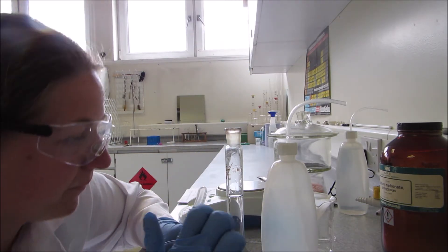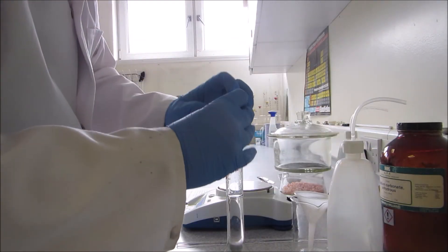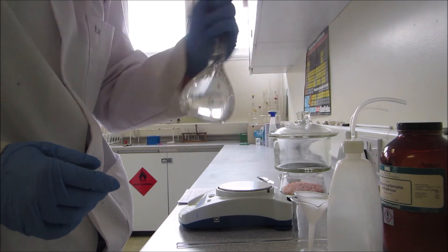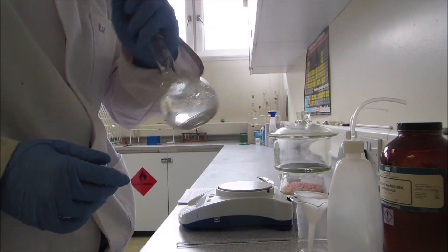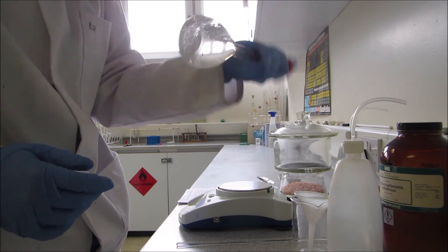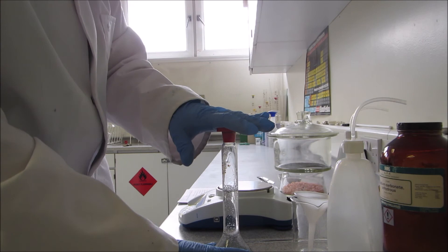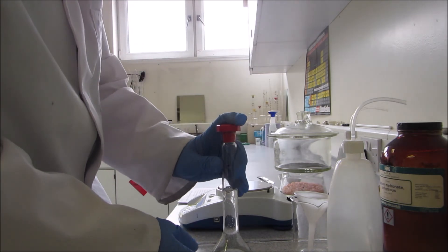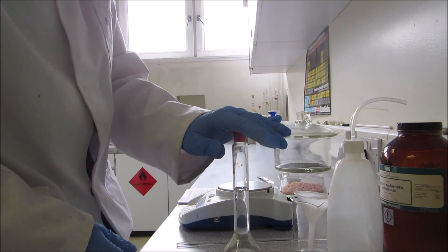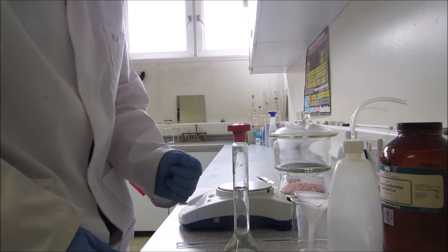And there we go. I put on my lid, give it a shake, and I've just made up a standard solution with 1.2 grams of sodium carbonate and 250 ml of water. The next step is to standardize this against a known solution to check the accuracy of my standard solution and calculate its true concentration. This will be done in another video.